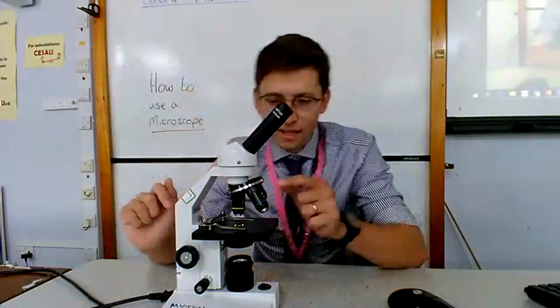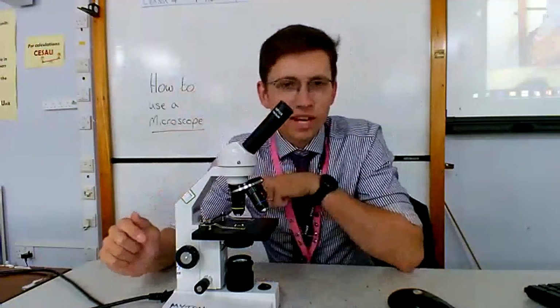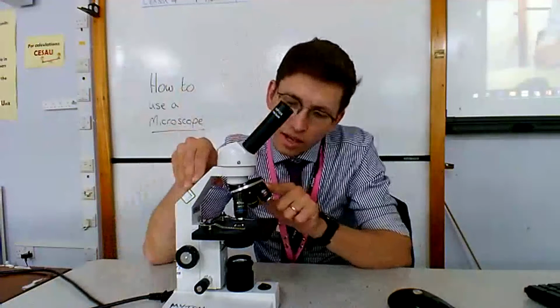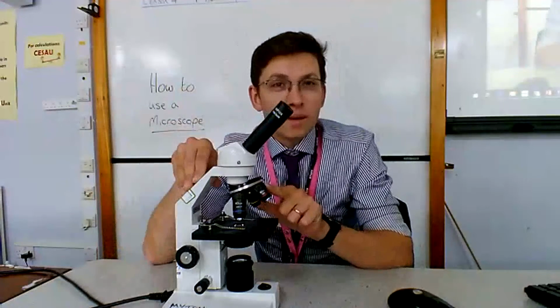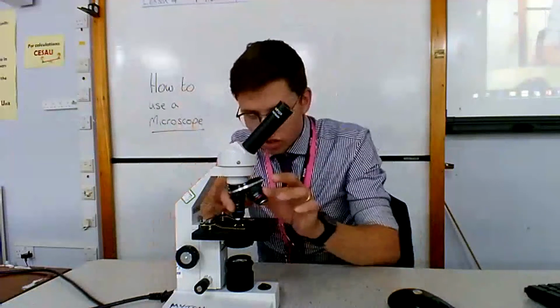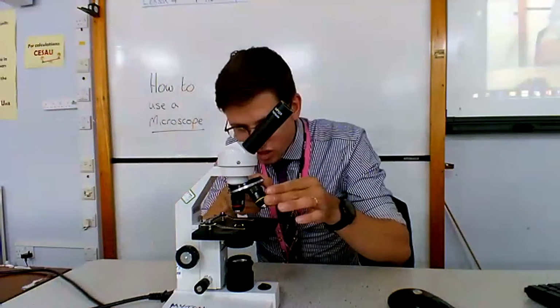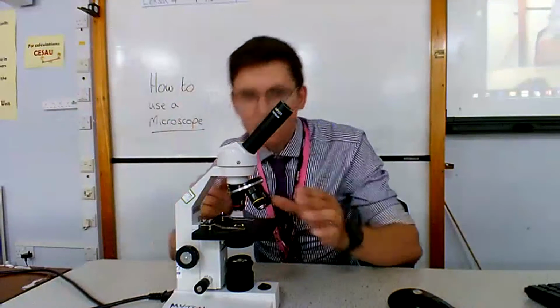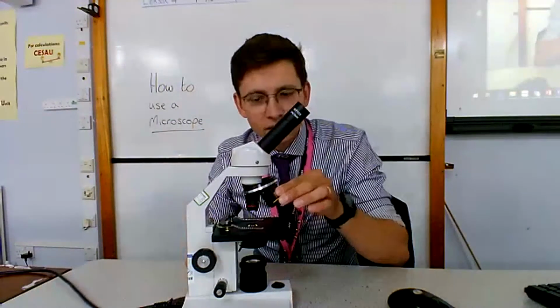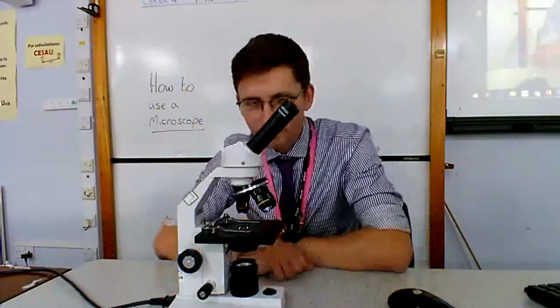Further down is our second set of lenses. Okay, these are called objective lenses. And these ones are nice and easy because the bigger the lens, the bigger the magnification. So the bigger the picture you'll see through the eyepiece lens. So to start with, I'm going to select the smallest lens. And it clicks into position. But we'll talk about that in a second.